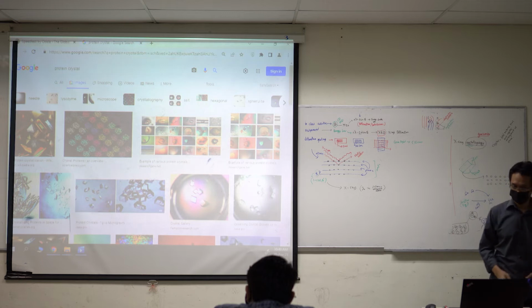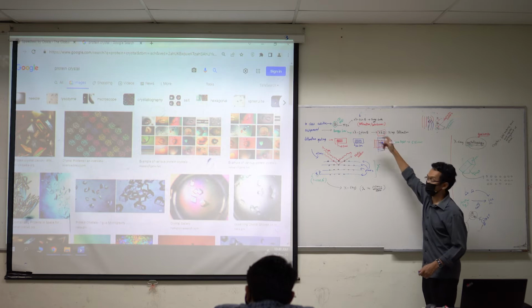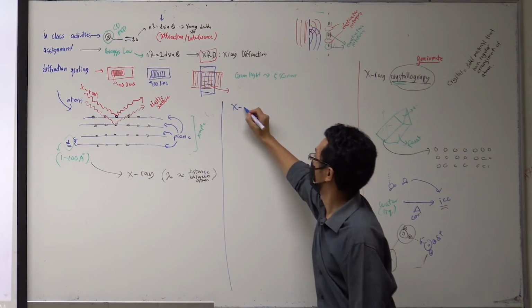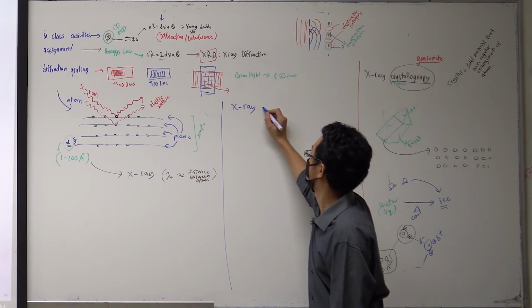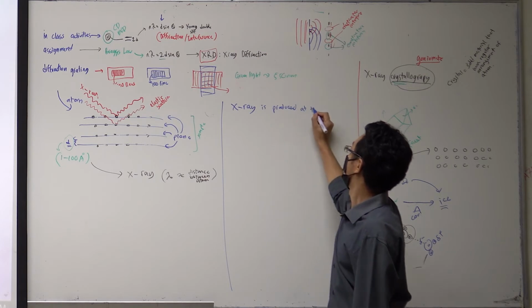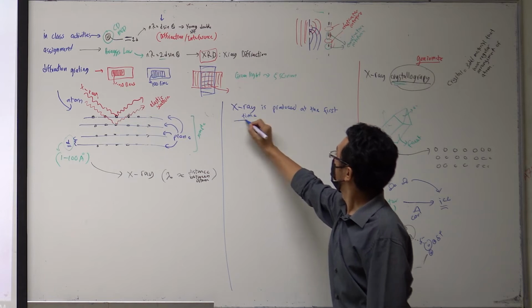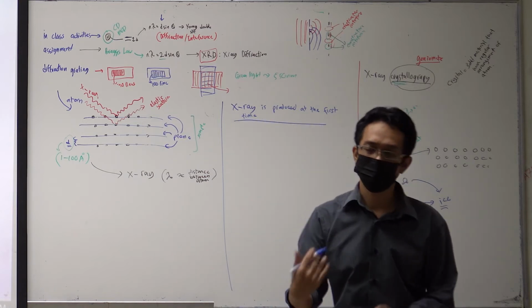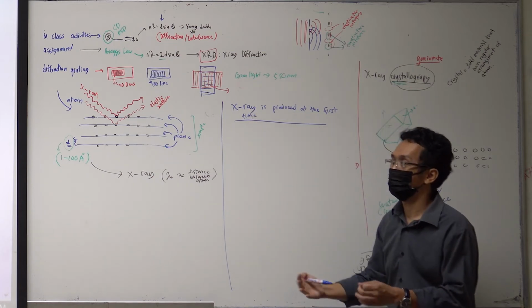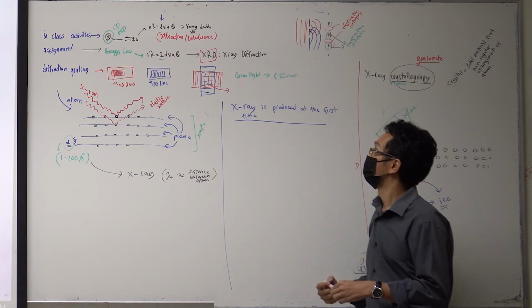But now, before we go to the other tools, because this is under XRD, let us see how X-ray is produced first. How X-ray is produced at the first time. Because understanding how X-ray is produced allows you to understand more when we deal with electron microscopy later on.